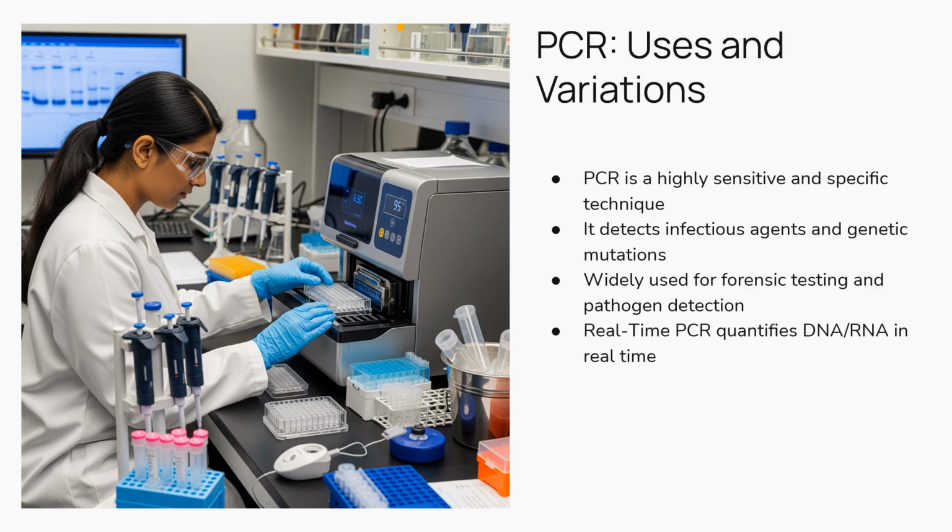Some advantages is it is highly sensitive and specific, so it can detect low copy numbers. It will give rapid results, often within hours. It is versatile, so it's applicable to DNA or RNA or multiple organisms and genes. It also has quantitative capability with real-time PCR.